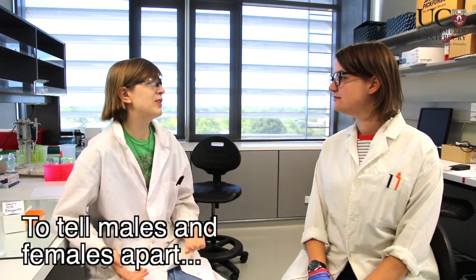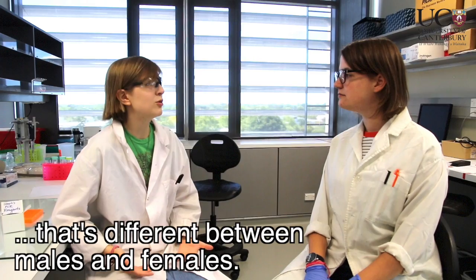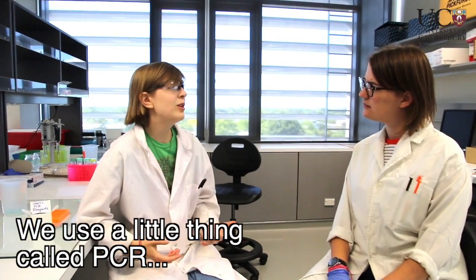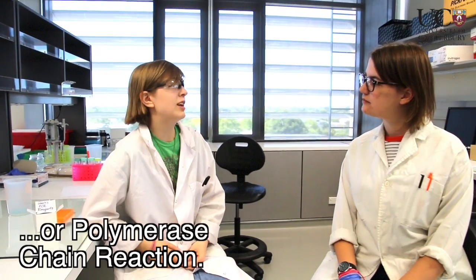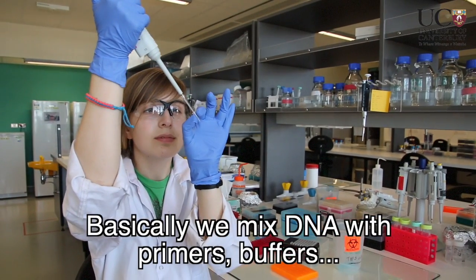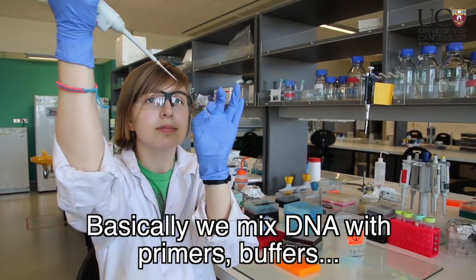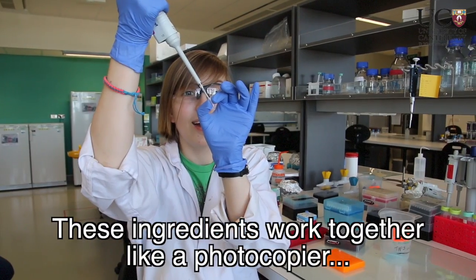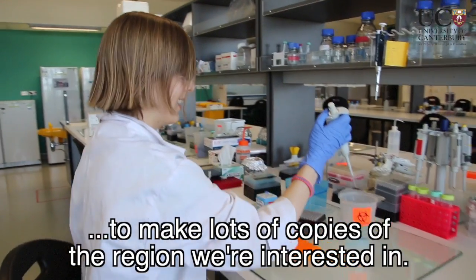To tell males and females apart, we need to look at the piece of bird DNA that's different between males and females. How do we do that? We use a little thing called PCR, or polymerase chain reaction. Basically, we mix DNA with primers, buffers, and a special protein. These ingredients work together like a photocopier to make lots of copies of the region we're interested in.